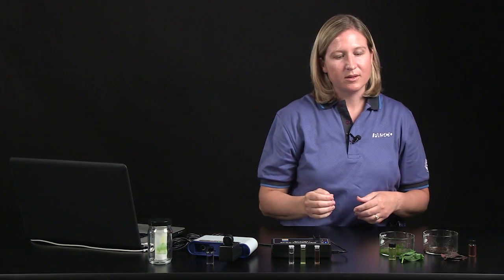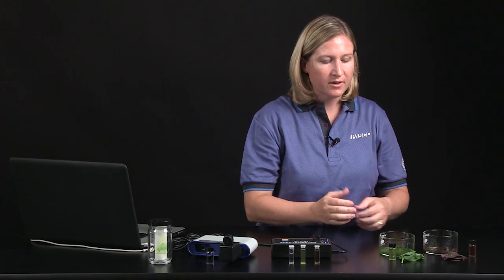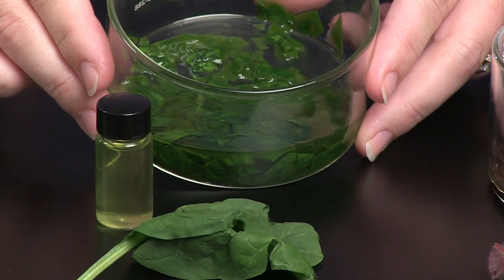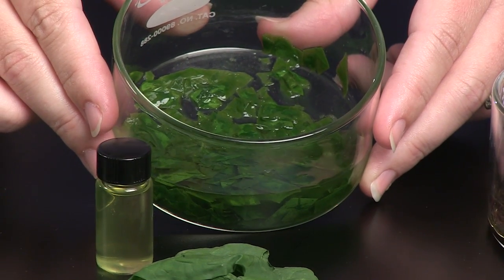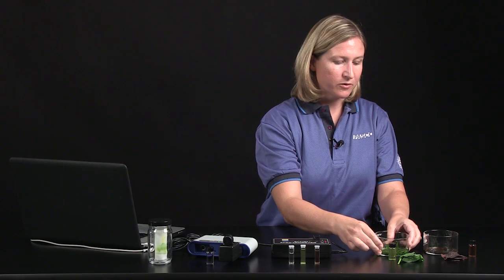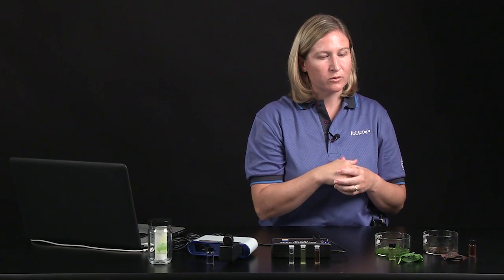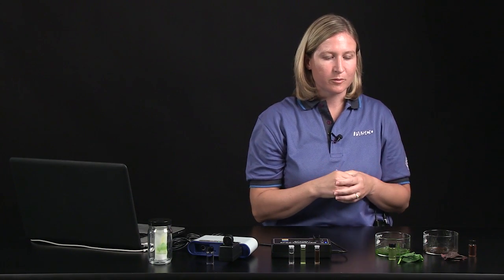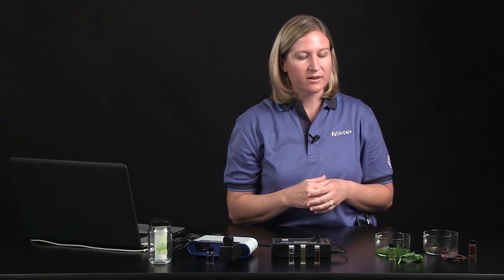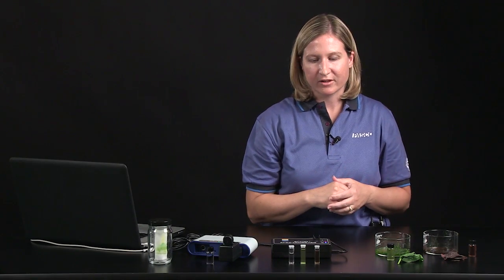To prepare the pigments for analysis with the spectrometer and colorimeter, I took some leaves, chopped them into little pieces with some scissors, and soaked them in ethanol. You can also use a mortar and pestle to grind the leaves up further. Then push the extract through cheesecloth to remove the solid material, leaving just the liquid pigment extract. I've already set up a vial here with my spinach pigment extract.